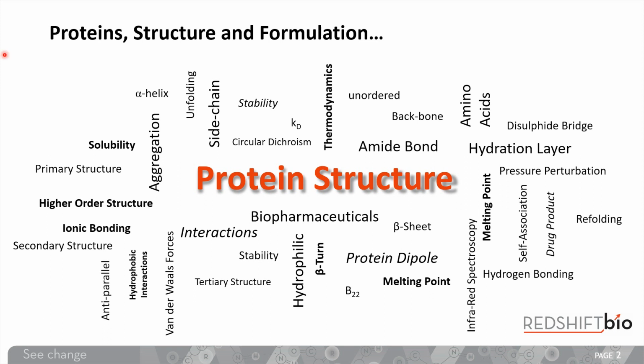Measuring protein structure can be a complex task that requires an understanding of many different analytical techniques and a broad understanding of how protein structure, function, and formulation can affect one another. As we know, protein structure can be very sensitive to changes in local environments, such as pH, ionic strength, temperature, and even sample concentration. When working in applications such as formulation and development for biopharmaceuticals, a full understanding of protein structure is really a two-sided coin.